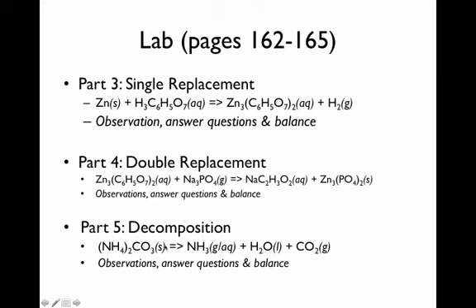So that's it for this particular lab. It's pretty straightforward. You're going to do a handful of chemical reactions. You're going to balance them, and you'll basically get to see what a decomposition reaction is, what a double replacement reaction is, what a single replacement reaction is.